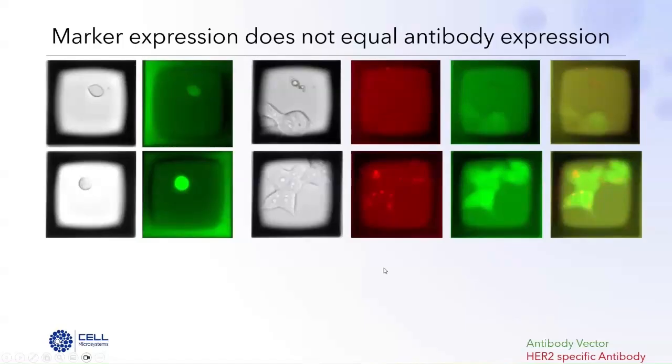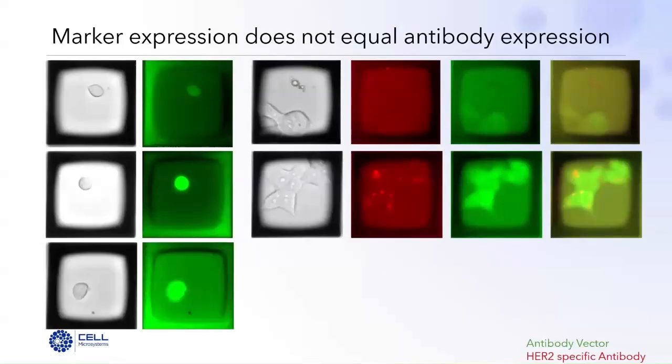Now the plot thickens a little bit when we start to look at what GFP high fluorescence actually means. Here's another example of a clone. You can see in this particular instance, you might argue that the cell on the bottom has more GFP than the cell on the top. But we're beginning to reach the limits of detection of the computer, flow cytometry software, and the human eye. It would be very, very difficult to use the GFP fluorescence to start to say which of these is brighter or less bright in any common segregation method.